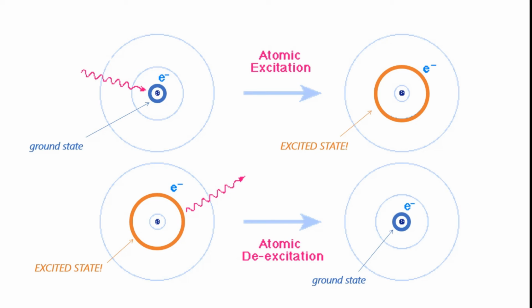Okay, so what we're going to be doing is taking these metals, and we're going to put some energy in, either as heat or electricity or light or something, in order to energize their electrons. Now, where the electrons usually sit, whether we write them out in the electron configuration, is called the ground state. These are where we expect to find the electrons, and what orbitals they're occupying.